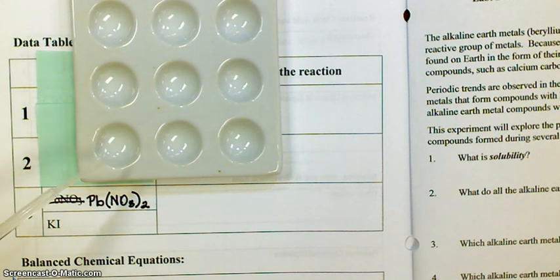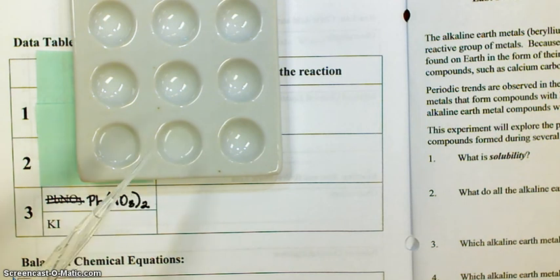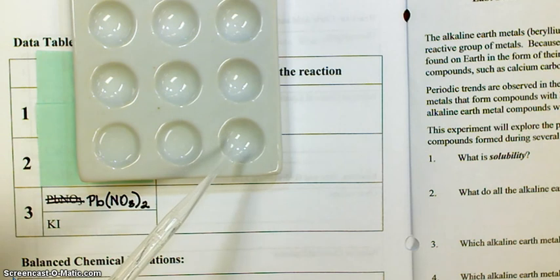Okay, so lead nitrate is going to go right here. Okay, it's a clear solution again, a clear liquid. Potassium iodide solution is going to go in the second well. It is also a clear solution. And I'm going to put some potassium iodide in the third one so that we can see what they do together.